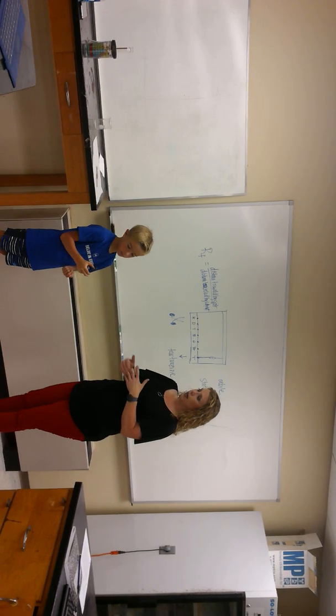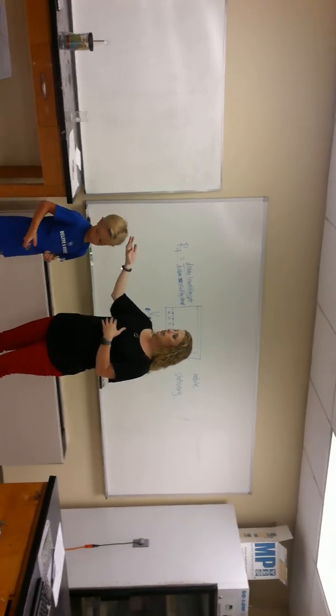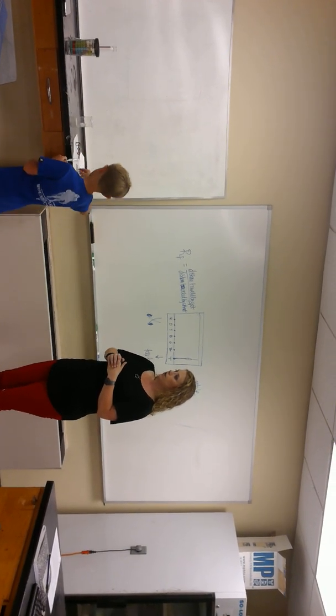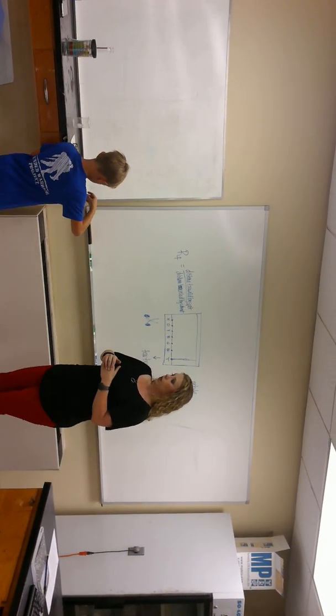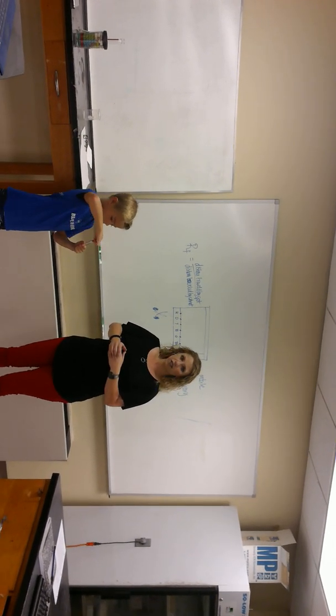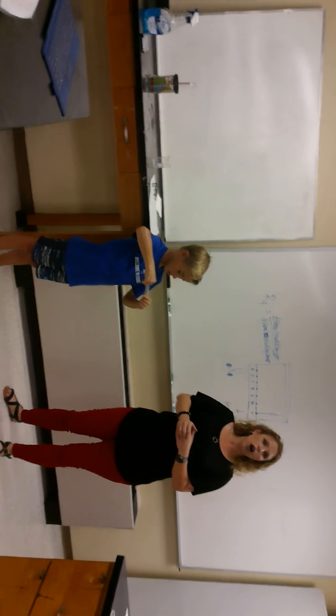Okay, so we're going to boil our yarn, and it says to pull them out with tweezers, but show them a problem with our tweezers. Yeah, we put our yarn down, and there you go. So what happens? It doesn't go all the way down. It doesn't go all the way to the bottom.